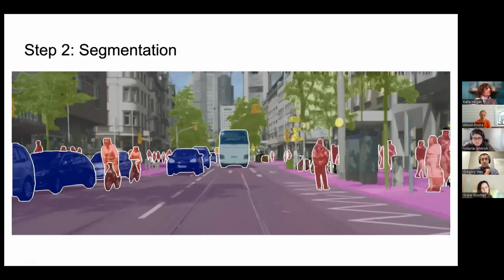The next step is a really important one too. It's called segmentation. It's actually a pretty big buzzword in tech right now, because both Facebook and Microsoft just released their large models. ChatGPT, I think most people have been exposed to and have heard news stories about, if not used it themselves in their jobs. One of the next areas of expansion for these types of models is computer vision, and there's a lot of research on this already.